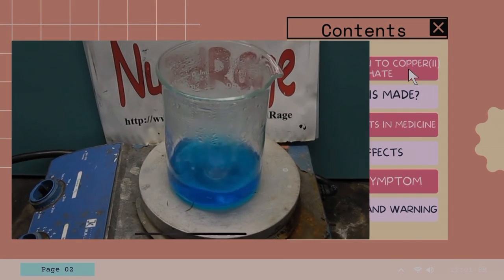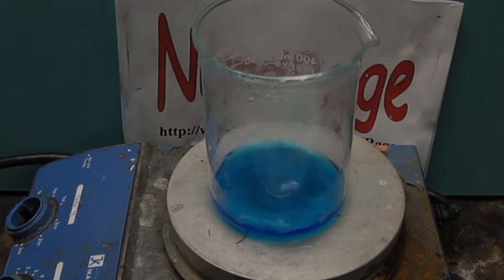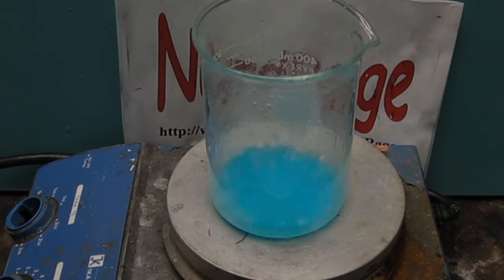The mixture will never boil completely dry, but the copper sulfate will precipitate out right about now. Here is the fine copper sulfate powder in the sulfuric acid. Just filter it off and recycle the acid to make more copper sulfate.